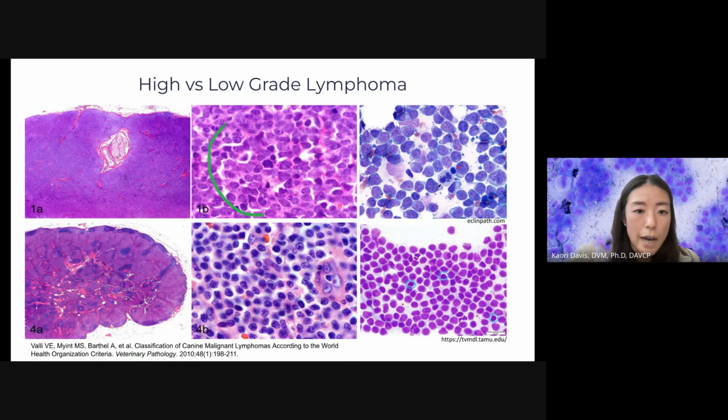Cells of high-grade lymphomas tend to be large, so they are larger than the red blood cells, and their nuclear size can reach up to twice the size of red blood cells or more. The chromatin is delicate, so the nucleus stains paler, and you can see nucleoli every now and then. Here, there is one mitotic figure. There are also some remaining small mature lymphocytes, one here and one here. Compared to these remaining mature small lymphocytes, basically all the other cells are much, much larger.